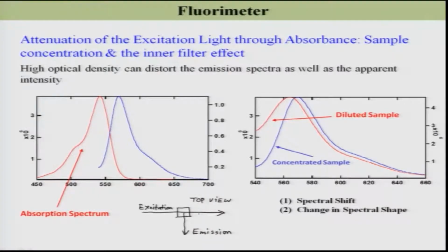In this case I am going to collect the emission from the middle side, right, and please note that we usually use a slit over here and a slit over here to collect this emission. This is necessary for the dispersion in the monochromator. So, using this slit, I am going to collect emission only from this region.